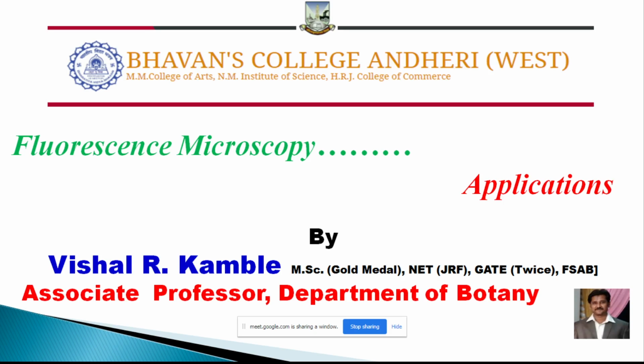This will be the fourth part of fluorescent microscopy. So related to this will be the concluding lecture, and after that we'll switch over to some other new content. So dear students, as you know, fluorescence microscopy is one of the important advanced techniques as compared to the conventional compound light microscopic technique.